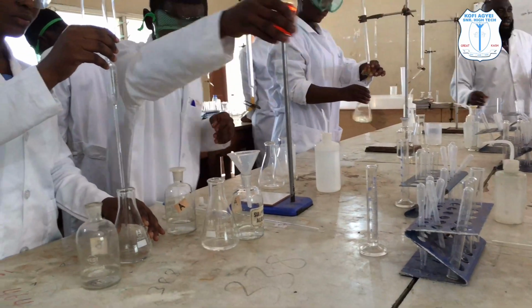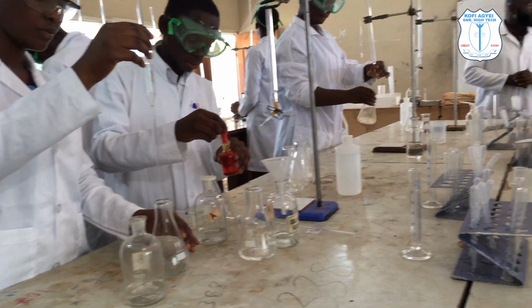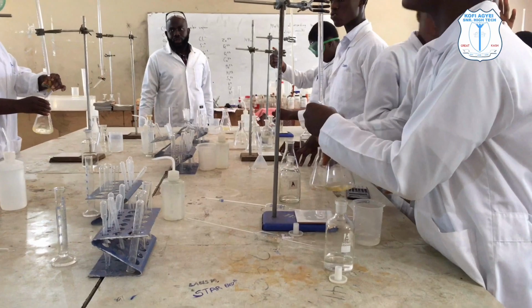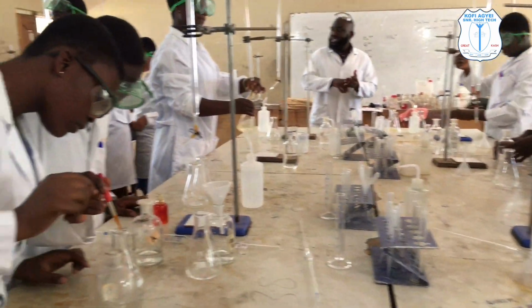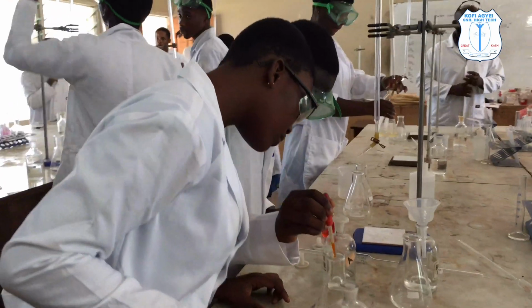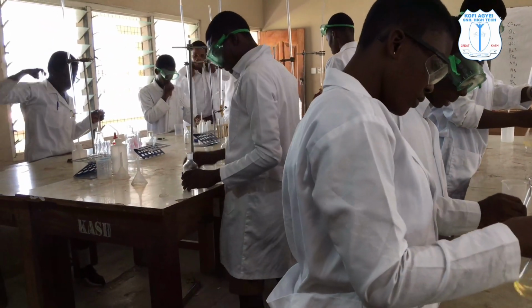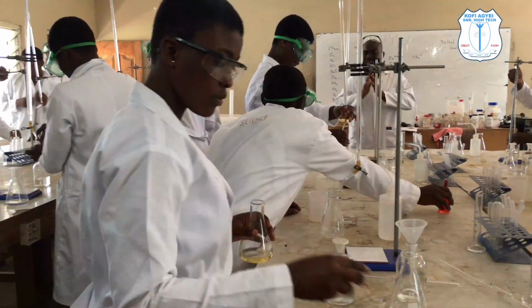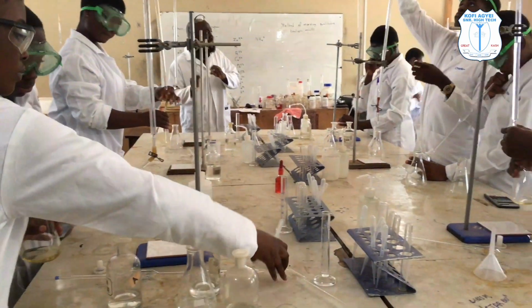So here what is going to happen? It's going to change from yellow to orange. Now, when you are doing the titration, remove the funnel. Once you get to the color change, that becomes the end of the titration. So you have to stop whatever you're doing. Once you use methyl orange, it's going to change from yellow to orange.